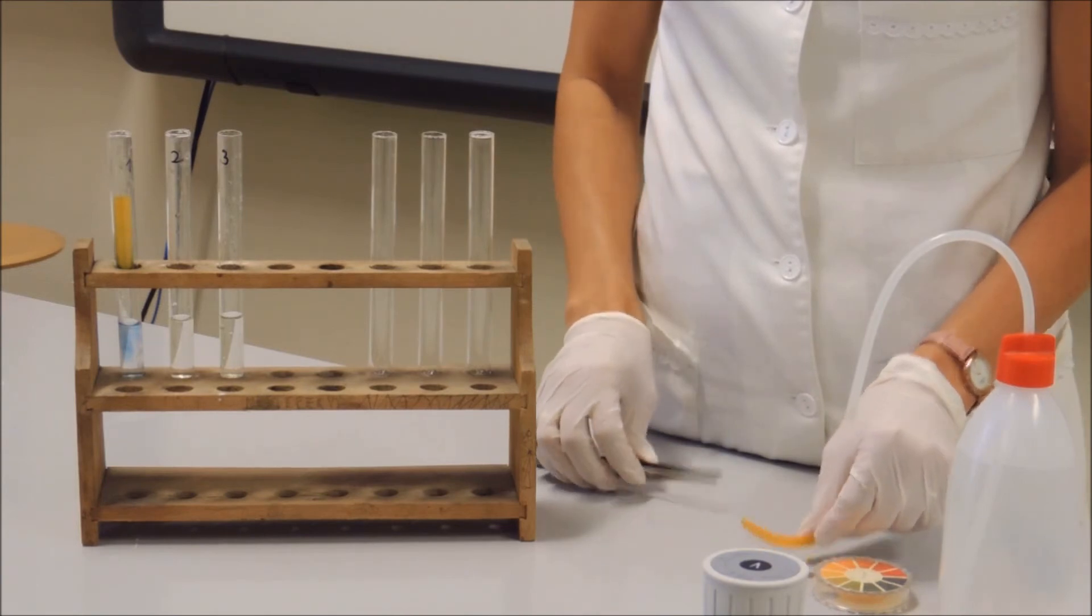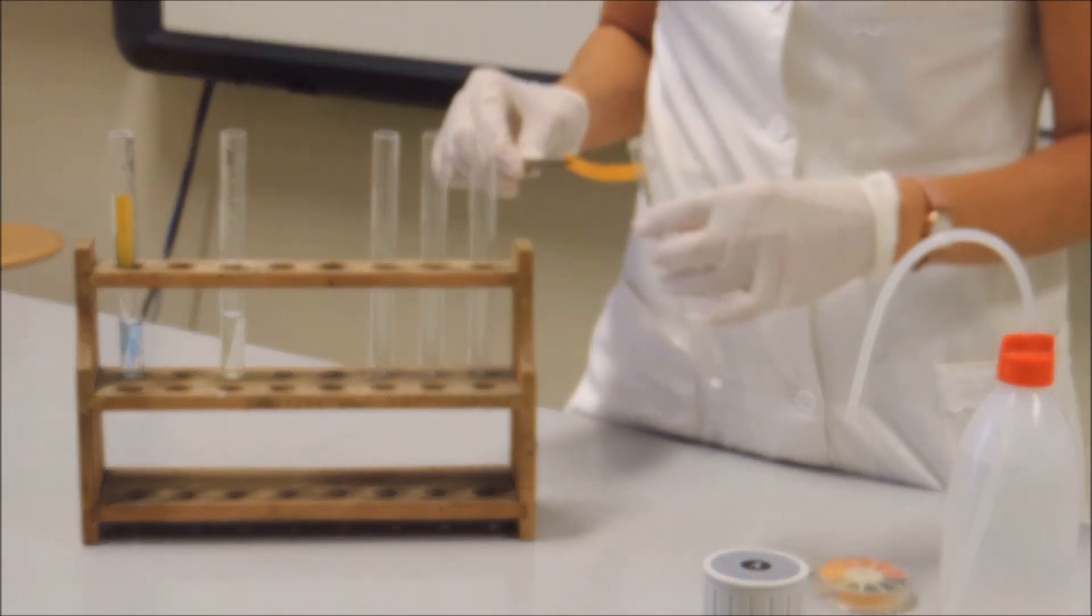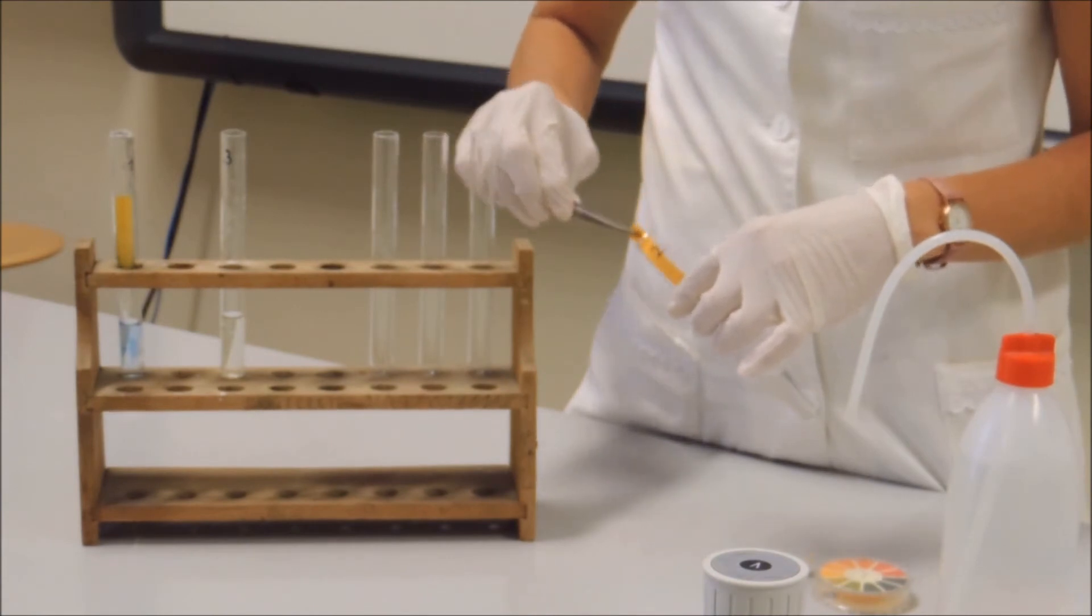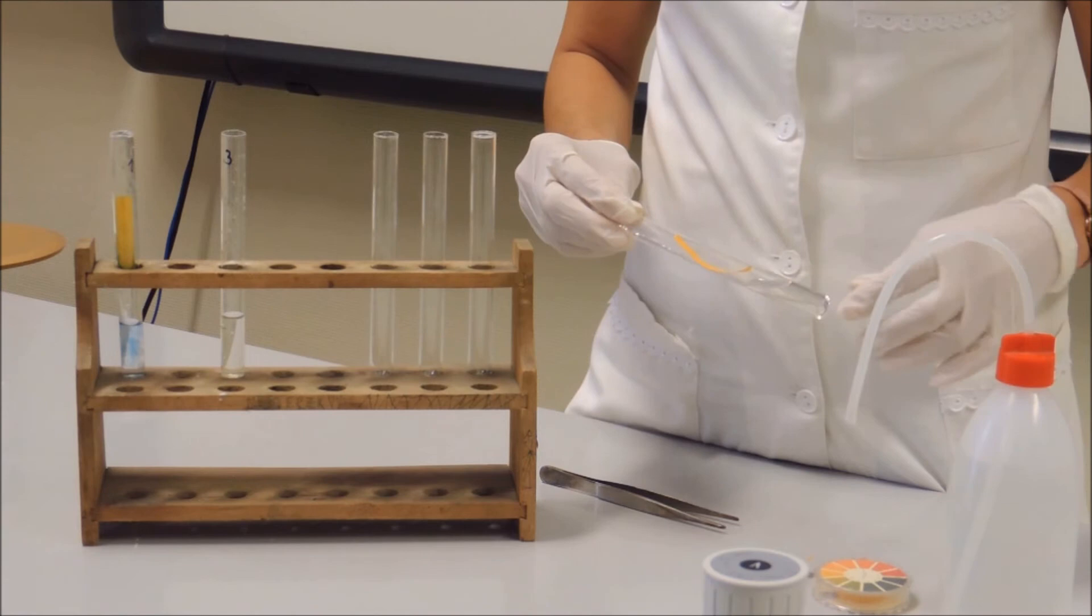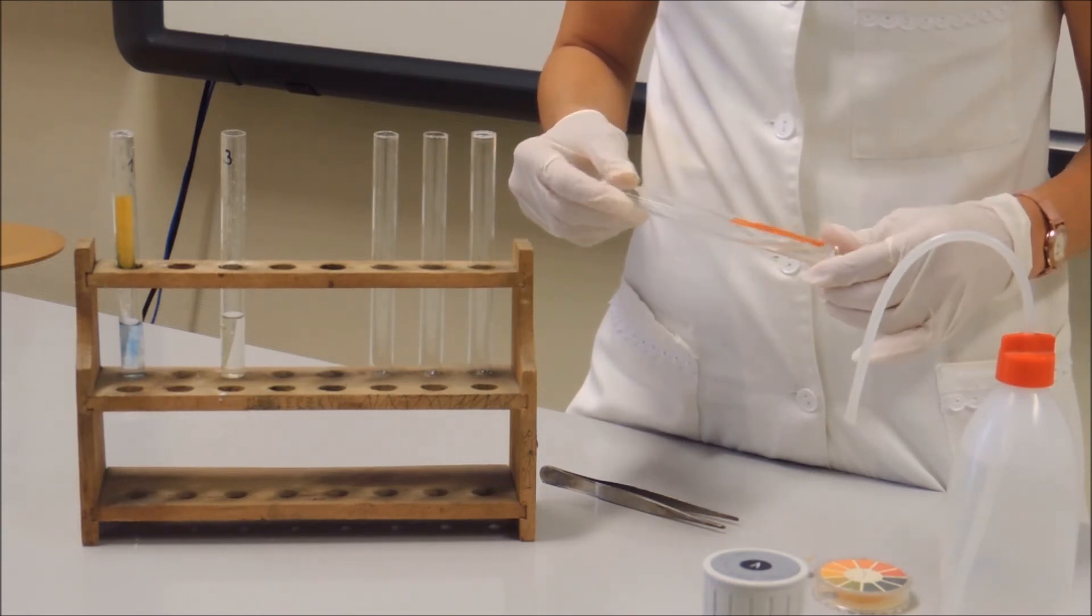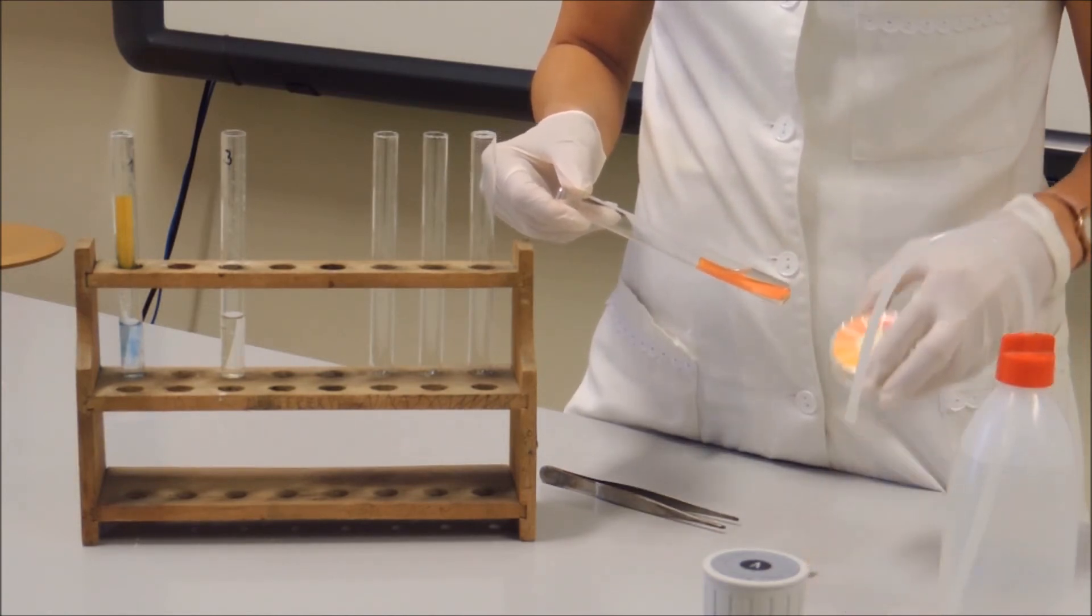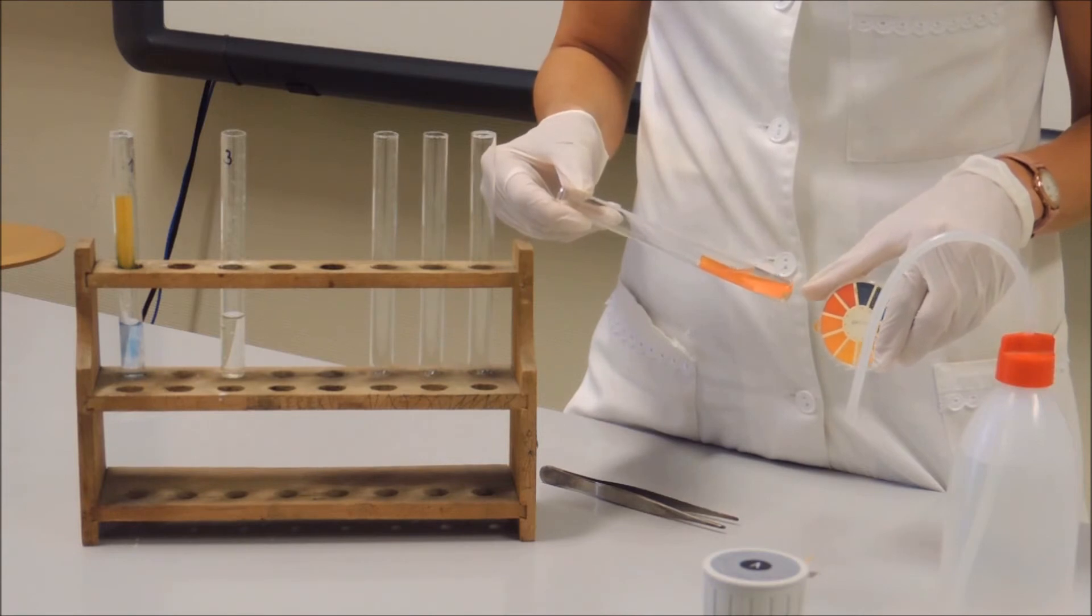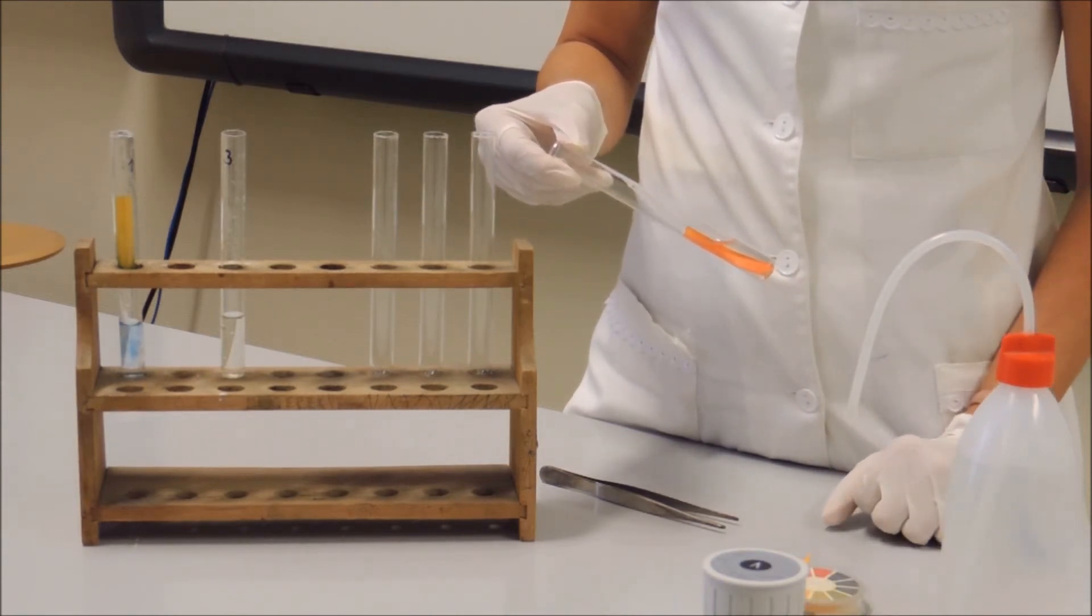Place the pH paper in the next test tube. The pH paper's color is reddish, the solution's pH is acidic, therefore the second test tube contains citric acid.